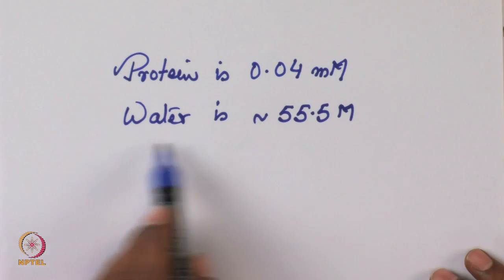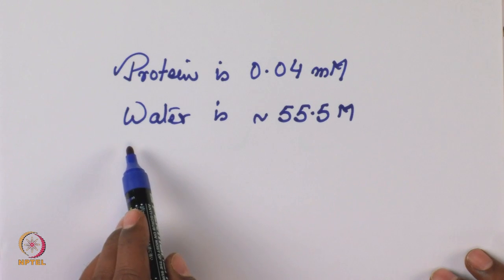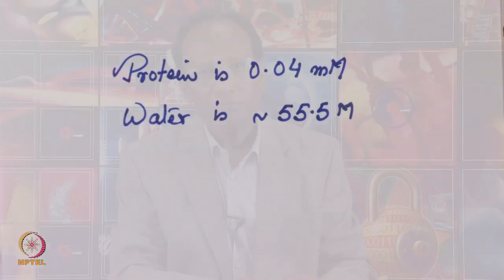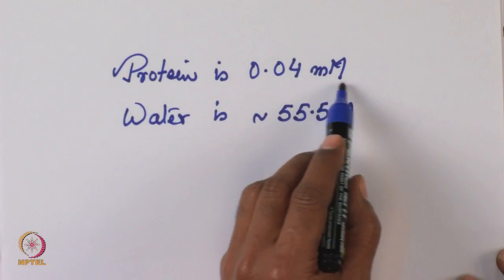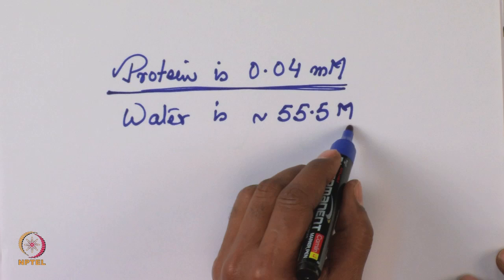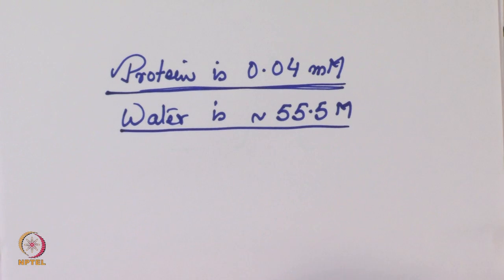Water has high heat capacity because there is an extensive amount of hydrogen bonding in water, and we are preparing protein solution in water or buffer, which is actually prepared in water. Therefore, how do we actually get information on heat capacity changes which are exclusively because of protein and get rid of water contributions to a large extent?